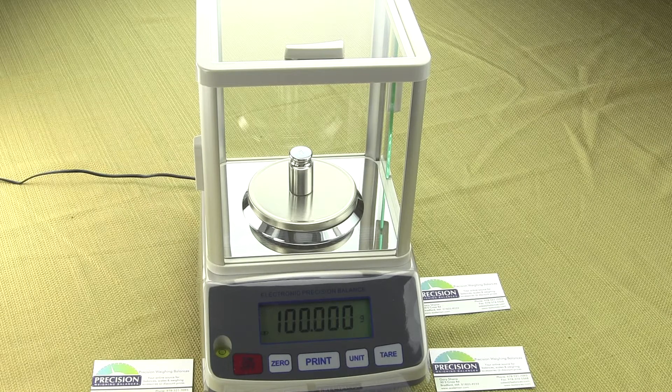There are three versions in the milligram series. The first is the EPB103, which is 100 grams by a milligram. Then there's the 203, which is 200 grams by a milligram. And the final model is the 303, which is 300 grams by a milligram. These models are a perfect alternative to someone looking to replace one of the Aculab VIC-123s or 303s, or the Sartorius AY series — the AY-123 or AY-303.